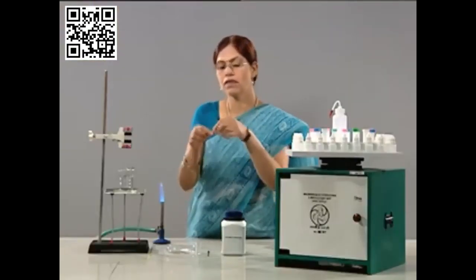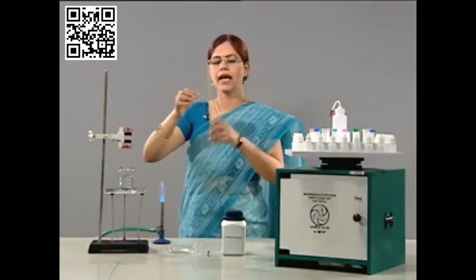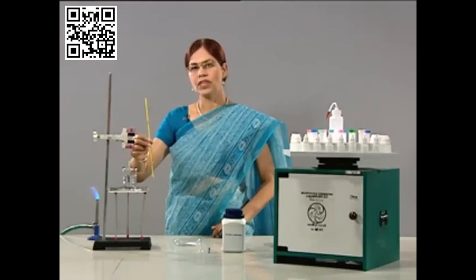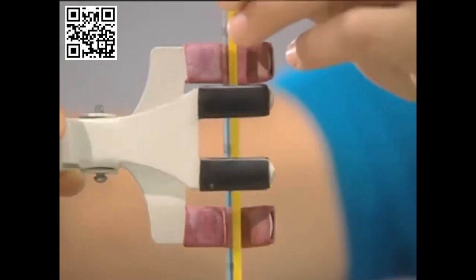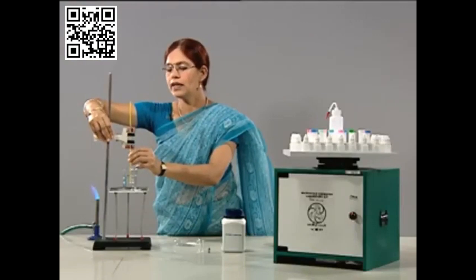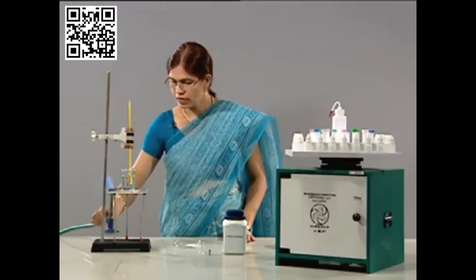Now we have this filled capillary tube. This we need to tie along with the thermometer. Now fix this thermometer along with the filled capillary tube in the clamp stand and lower it into water which is already there in the beaker, and start heating the beaker containing water.